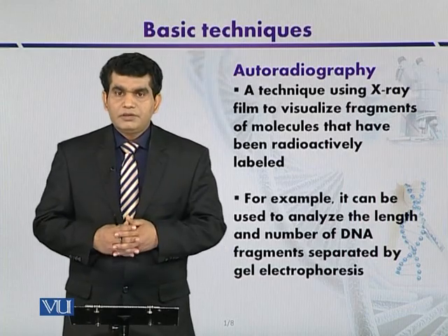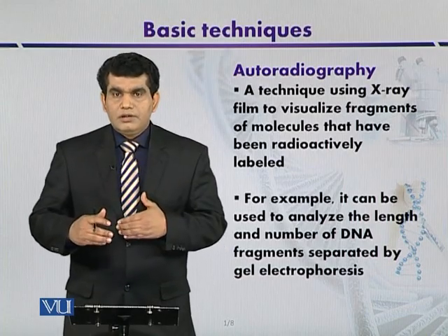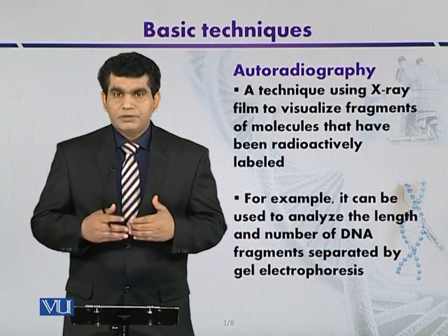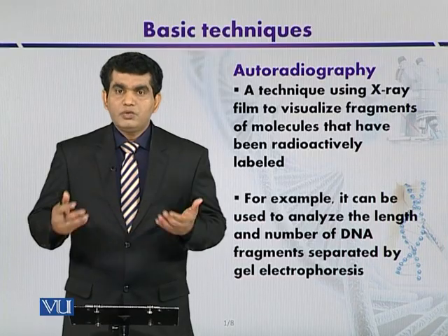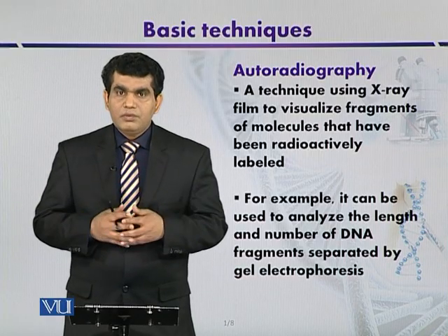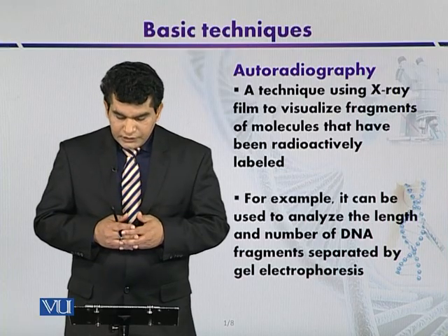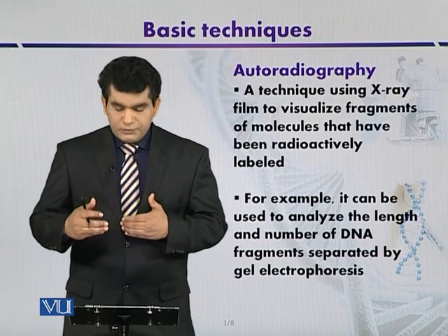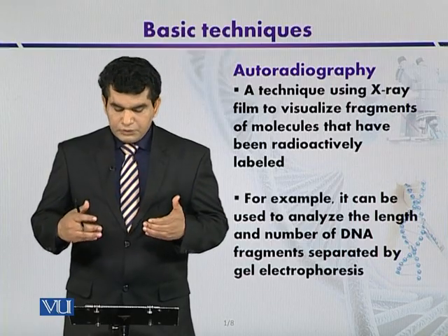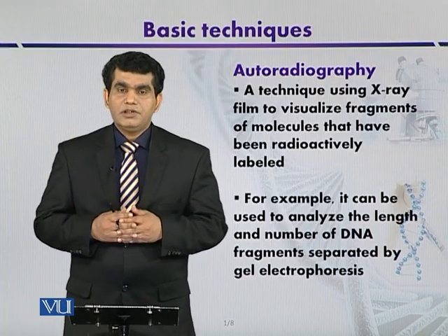When the fragments from the gel have moved to the solid support, like the membranes, then they can be visualized by autoradiography. What is autoradiography? It is a technique using X-ray film to visualize fragments of molecules that have been radioactively labeled.